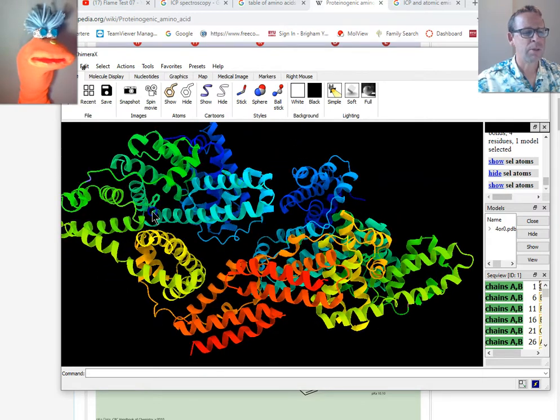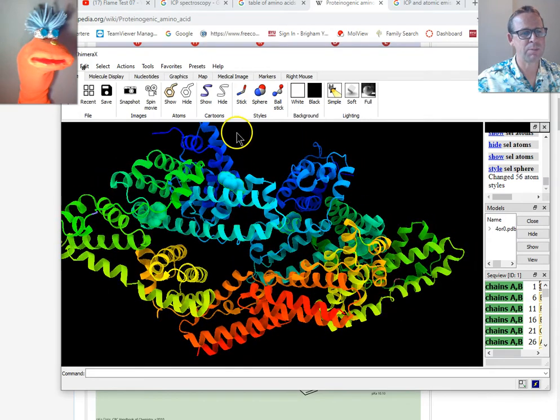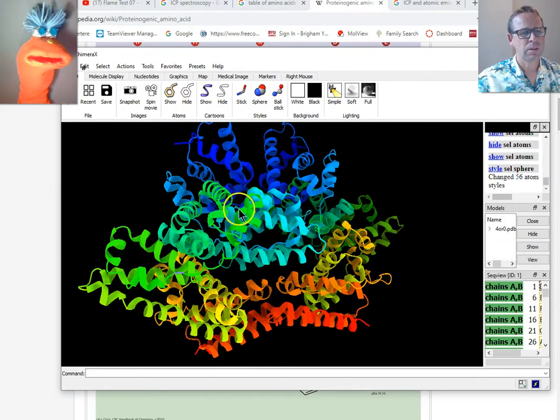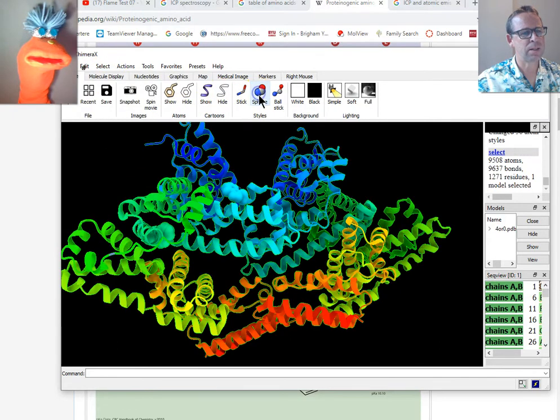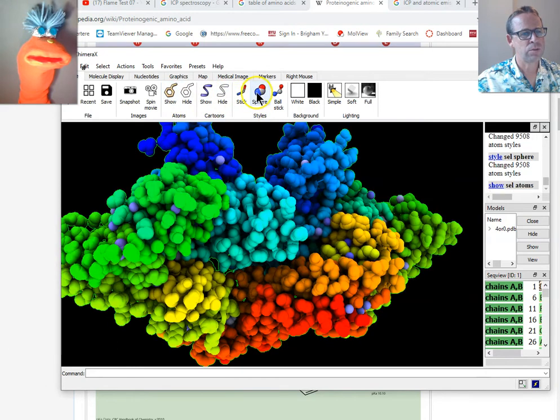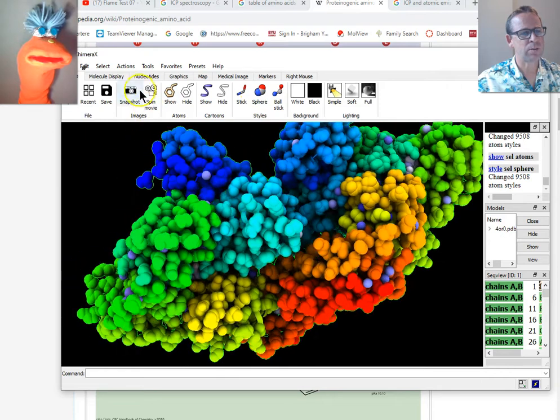Well, let me take this whole protein here and project it as, first, let's take those amino acids that we selected, and we project them as spheres, as where their electron density would be. And then if we select the whole thing and do that same thing, make it all spheres. Show, there we go. Okay, so now we got the molecule. Let's get rid of its glow.